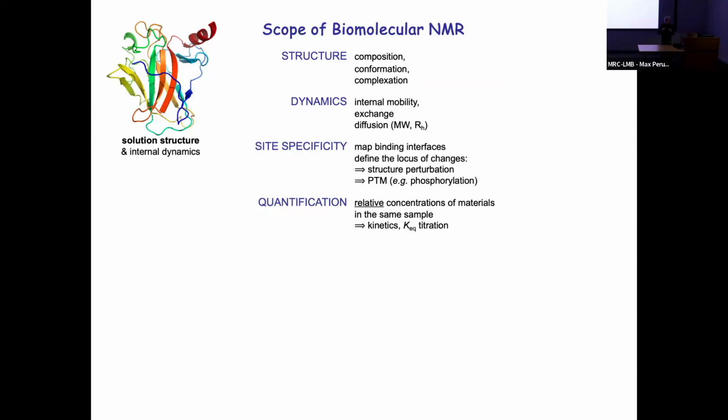Very often the mobility of the protein is instrumental as to the mechanism of action, how they recognize and how they catalyze reactions. So knowledge of the different conformational states that are present in the ensemble is an important aspect for us. So it's always been a good selling point for NMR that we can take images of the molecule in solution, and we also get the time dependence of any motions that are happening in loops, which can, in many cases, be clinically significant.